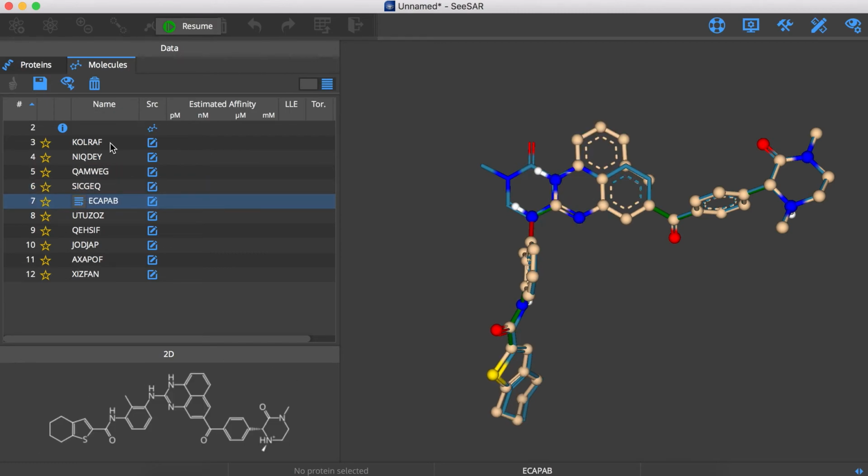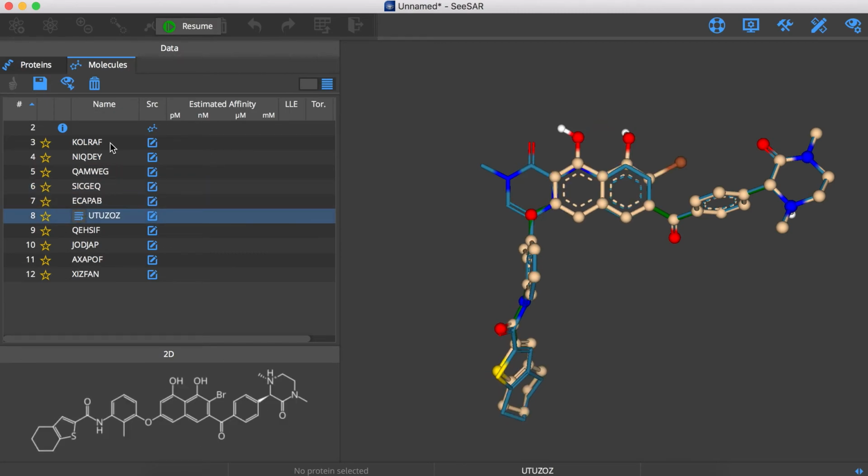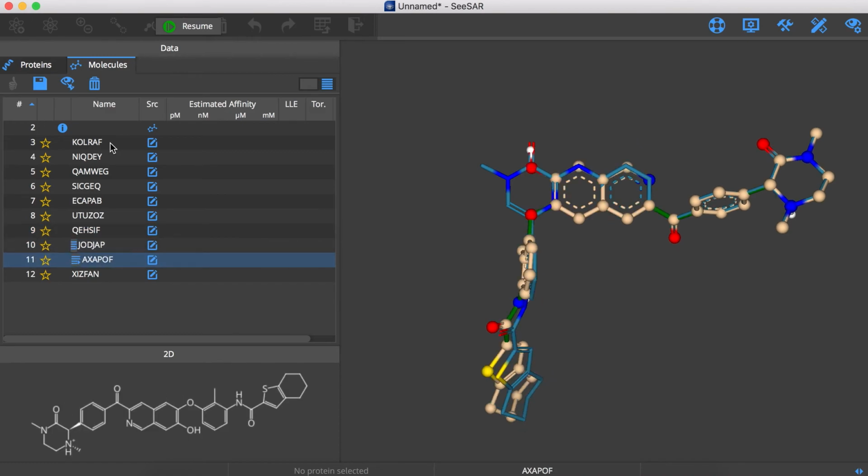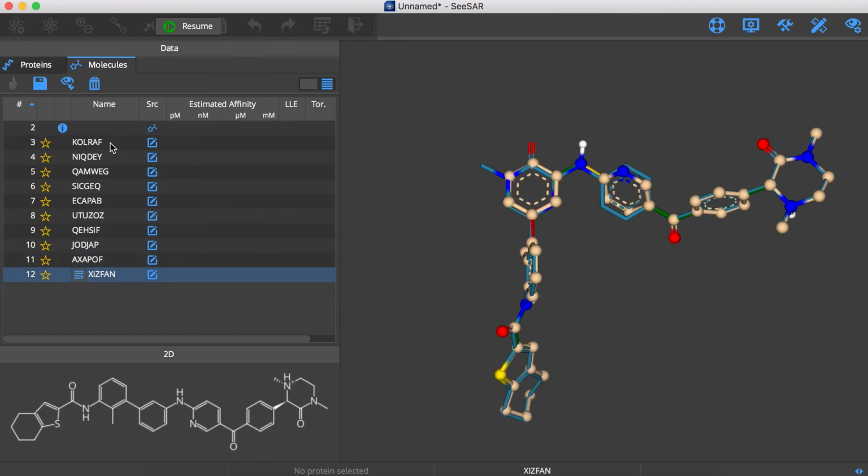This can be done for all of them simply by going through each of them in the table. You can then select the ones that you like. We can select just a few, or a sequence, and these molecules can then be saved into an SDF file.